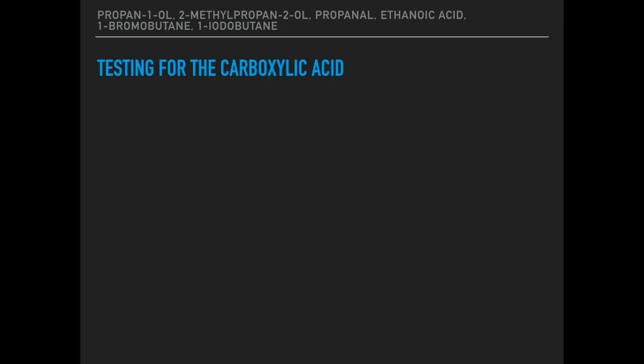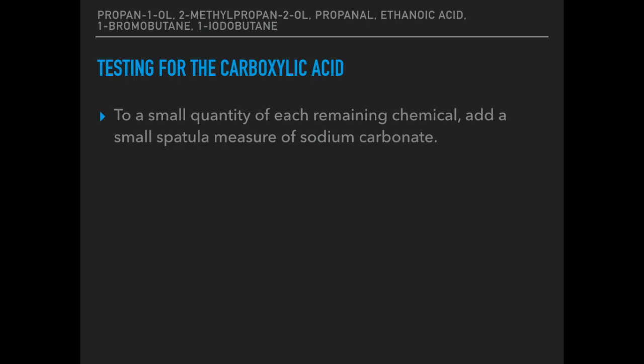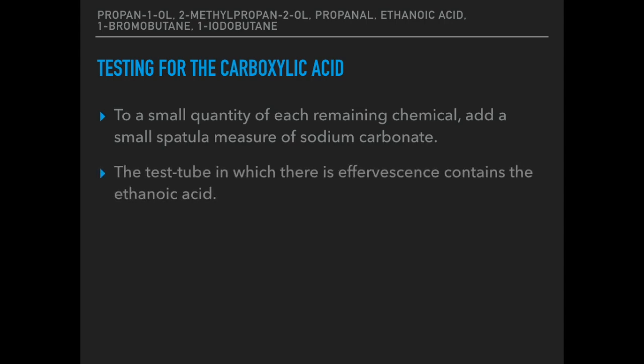The next test is for the carboxylic acid. To a small quantity of each chemical, add a small spatula measure of sodium carbonate. That's going to react with the carboxylic acid — it's the only one that does. The test tube in which there is effervescence, bubbling, or fizzing must be the ethanoic acid. The equation for that reaction shows the neutralisation of the acid by the carbonate.